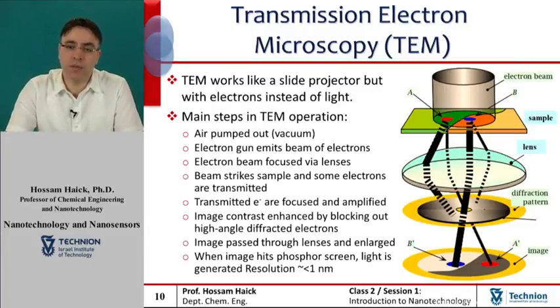Resolution of the TEM is limited primarily by spherical aberration, but the new generation of aberration correctors has been able to partially overcome spherical aberration to increase resolution. Hardware correction of spherical aberration for high-resolution transmission electron microscopy, usually abbreviated HRTEM, has allowed the production of images with a resolution below 0.5 angstroms, or 50 picometers, and magnifications above 50 million times.